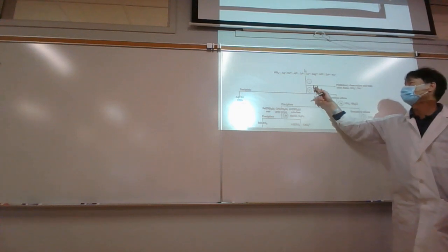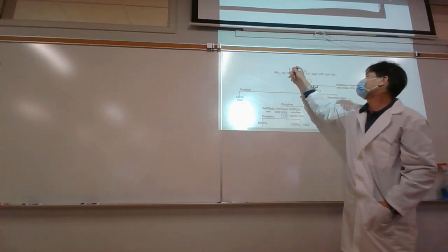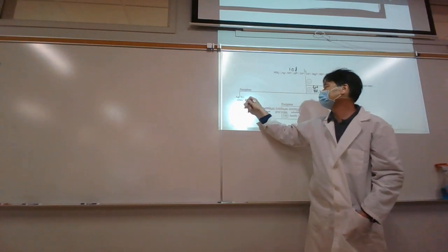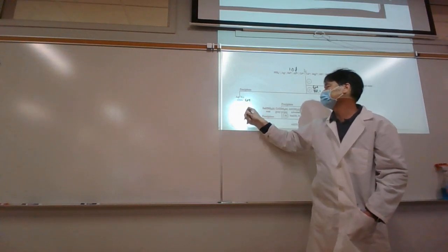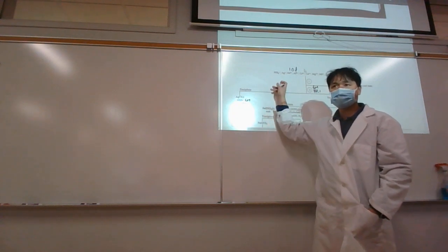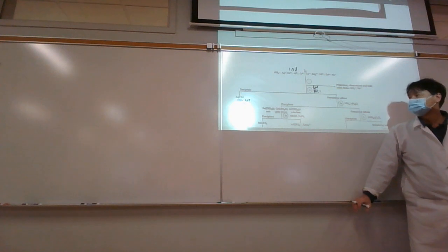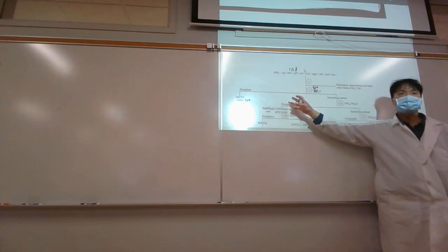So here, I just write 6 molar HCl. Here I'd write 10 drops. Here I just write 6 molar ammonia. Here I write 6 molar nitric. We're using 6 molar of all these, the dilute. And then I'll just have the flow chart like this.